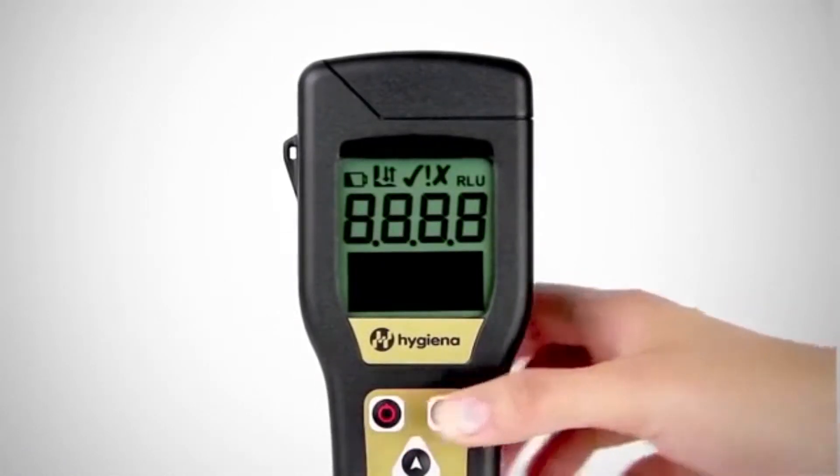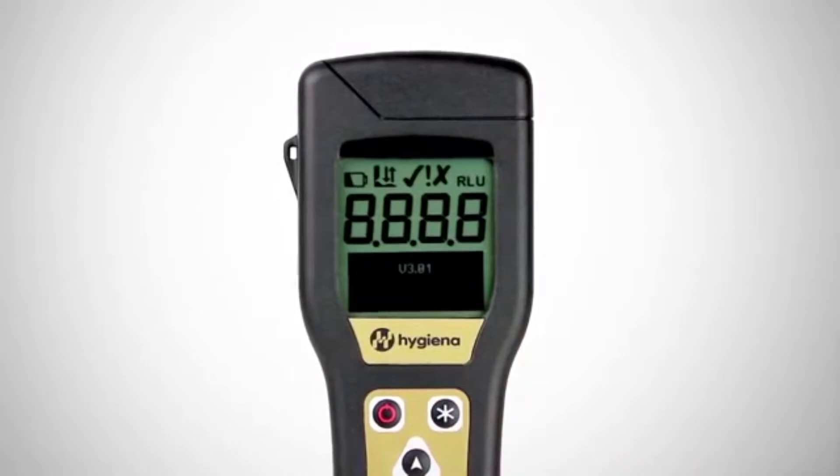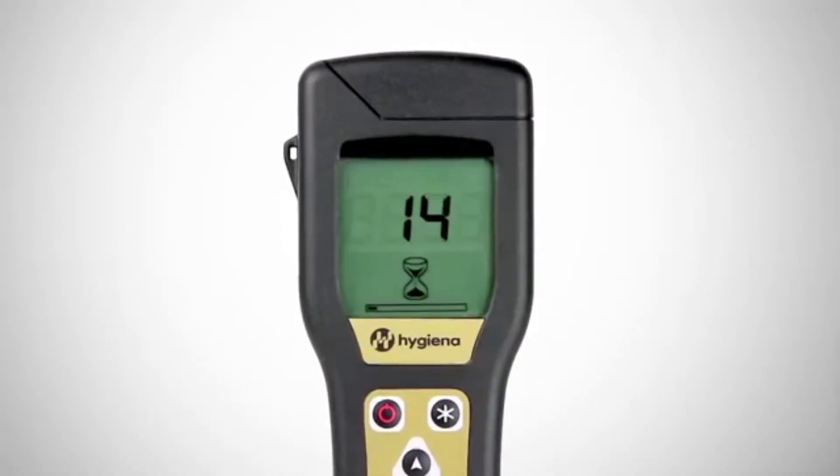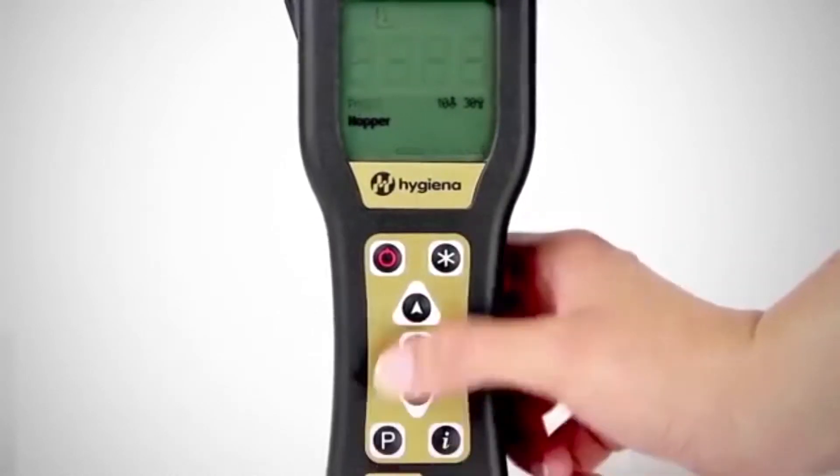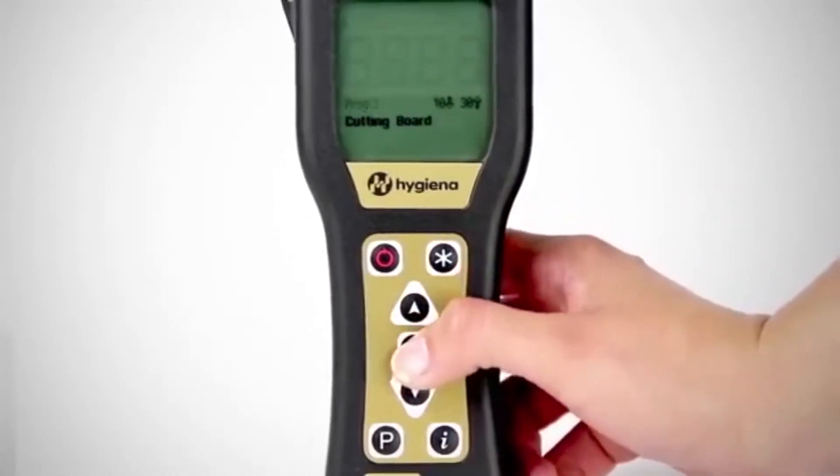Now let's see how it works. Turn on the luminometer before you begin testing to allow time for the system's calibration self-check to run. If you've already programmed test locations into your luminometer with SureTrend software, select a location to be tested.